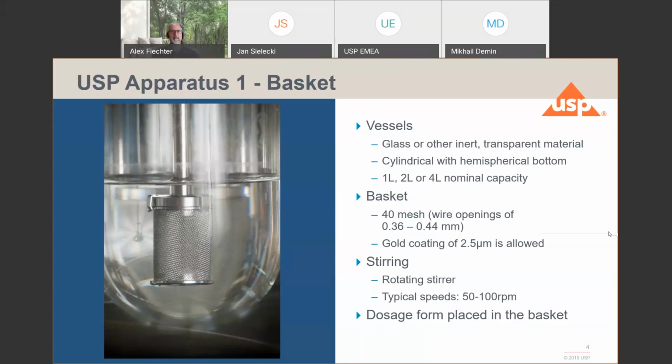The dosage form for the basket is placed inside, which has some pros and cons. For material that is floating, or buoyant, if you introduce it into the vessel, you have an opportunity to keep the dosage form immersed all the time, so that material is not coming up to the surface of the media, which also gives you a more constant release characteristic.